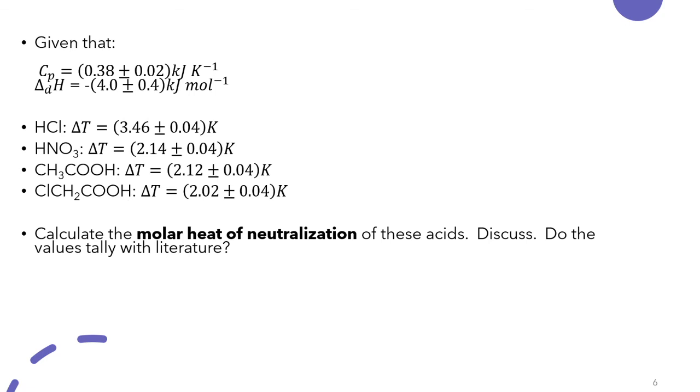You need to do some research as well, from the web I guess, if you don't have a textbook, to find some resources to discuss the delta H of each of the heat of neutralization of each of the acids. So that's something that I want you to discuss on, the trends and what is to be expected.